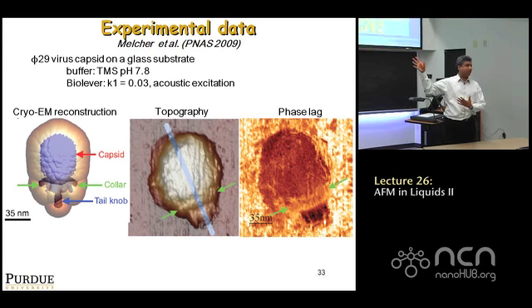That figure is just shown because whenever you show high resolution images of viruses, people like to see whether that's real or reasonable. And for viruses, at least for bacteriophages, you have cryo-EM-based databases that tell you exactly what the shape is.